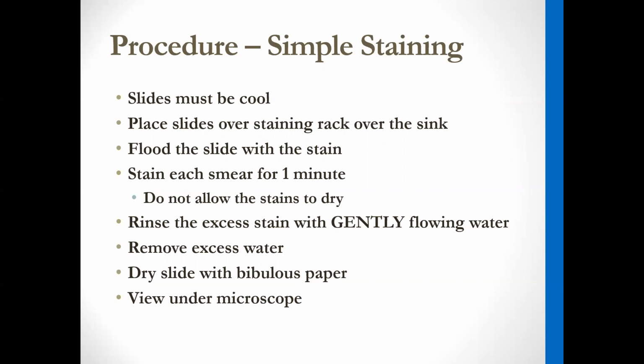Okay, it would be kind of like blasting us with a fire hose, right? So you want to squirt the water so it hits the top of the slide and just gently runs down. So it's rinsing the slide without disrupting the cells that you've attached to them. And then you can give the slide another little flick to get the excess water off. You can dry it with bibulous paper if you want, but then it's ready to go under the microscope.